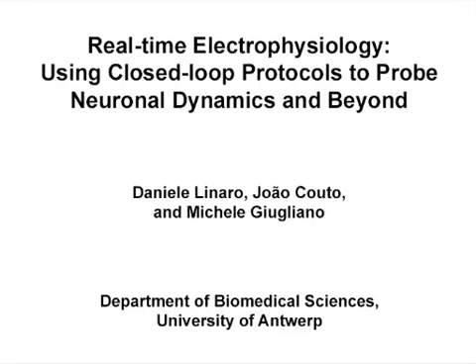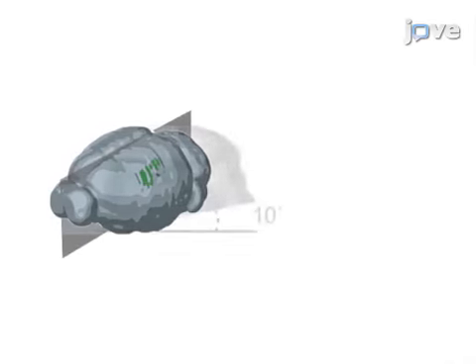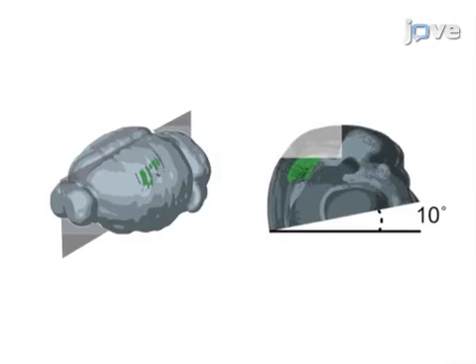The overall goal of the following experiment is to perform in vitro dynamic clamp in cortical neurons using the freely available software toolbox LCG. This is achieved by preparing slices of rat somatosensory cortex for patch clamp recordings from the pyramidal cells.